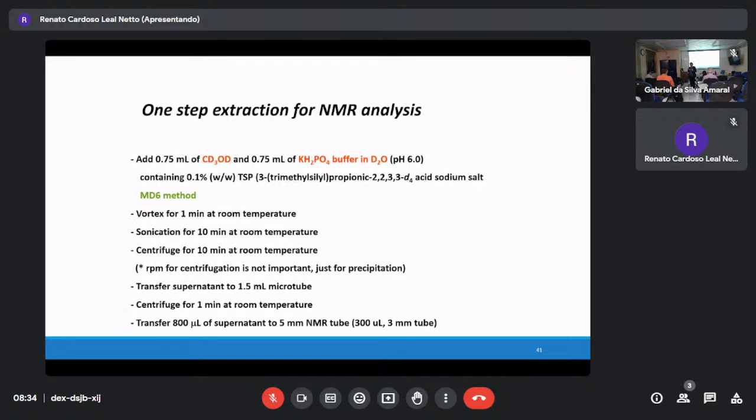to remind you, in modern metabolomic profiling you will use statistics. Then chemical shift is a variable. One time it's 1, second time 1.1. The chemical variable is different. Like sometimes I call Fatima, sometimes I call Maria. This is different. Of course, if I have a very nice relationship with one, she will accept it. But if someone calls differently, different compounds, that's all. So the most important factor that changes the chemical shift is the pH.